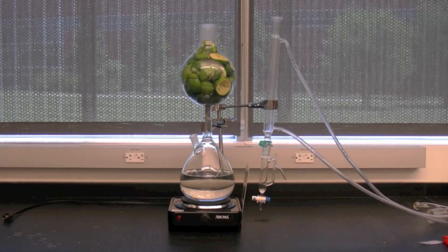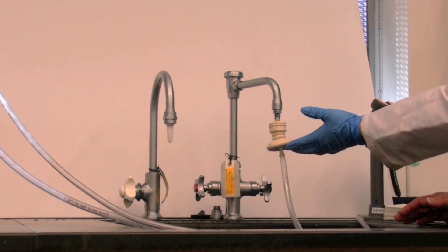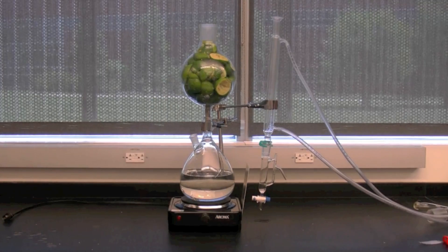Cold water should enter at the bottom and exit out the top. Connect the inlet condenser tubing to the cold tap water using the cream-colored faucet adapter. Make sure the outlet condenser tubing drains into the sink.